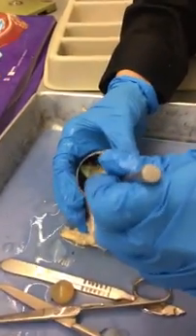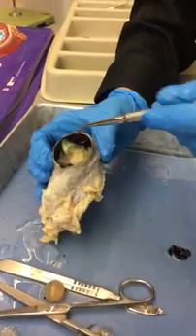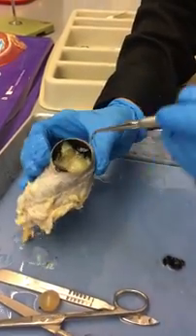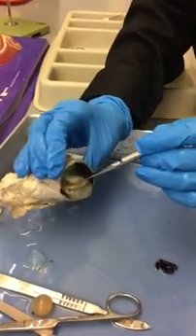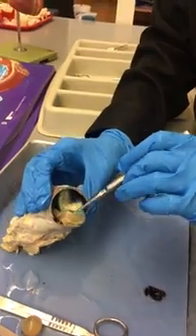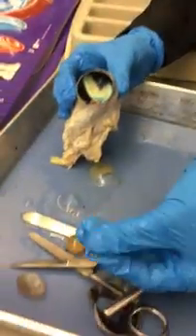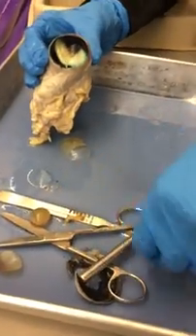You see this yellow thing right here that looks very delicate and looks like tissue paper? That's the retina. That's what makes vision possible, your retina. So it's really attached to the vitreous, so they come off together usually like this. So here's the retina. As you can see, very thin and delicate layer.